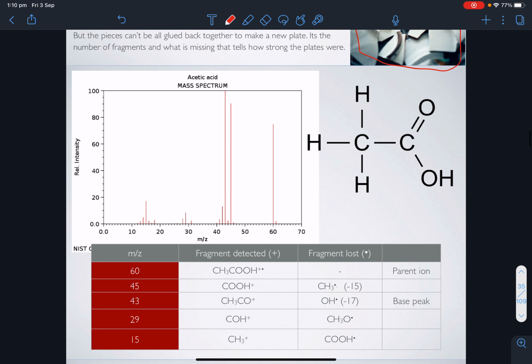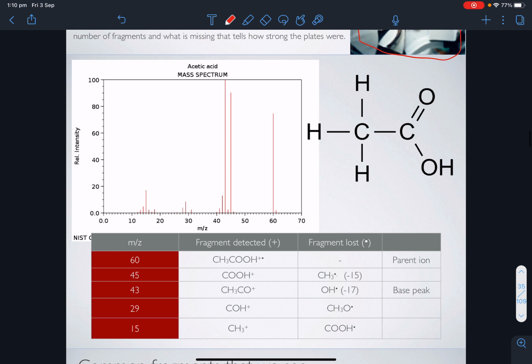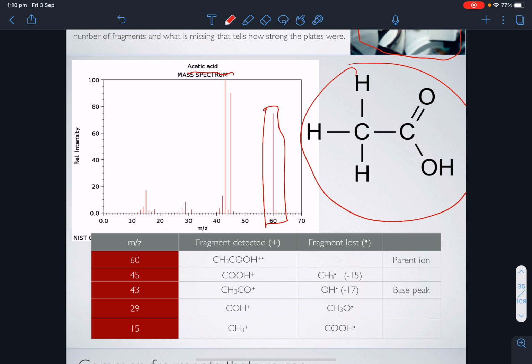Okay, so here I've got another mass spectrum to show you. This one's of ethanoic acid, old name acetic acid. I've given you the structure here. You can see that the parent peak here is, I'm laughing because there's a little peak after that, and I'll get to that. The parent peak here is 60. There's a little blip on 61. I might just bring it up now anyway.